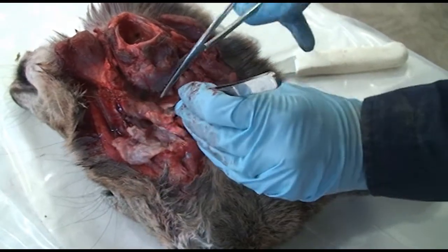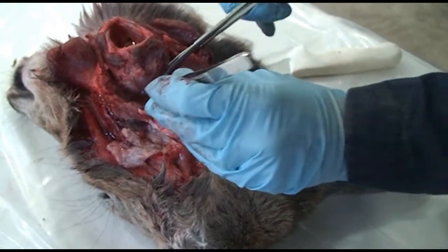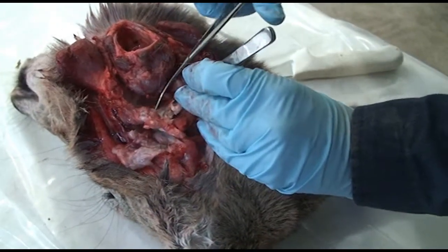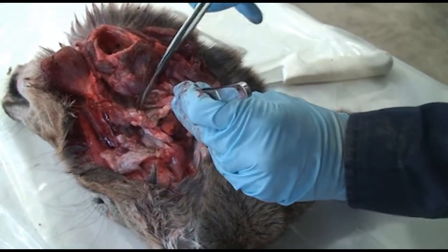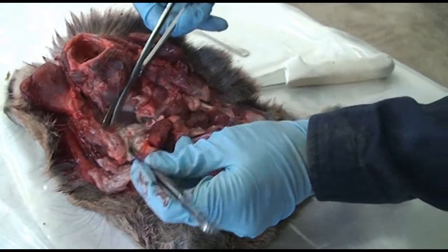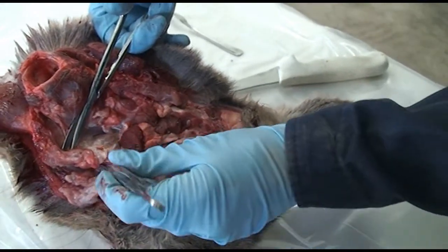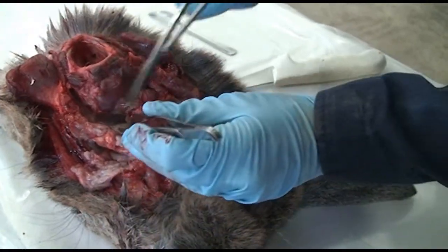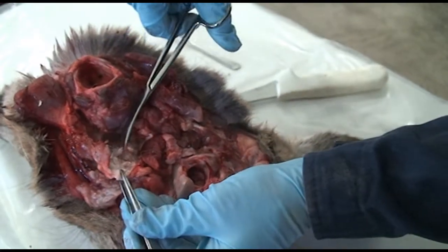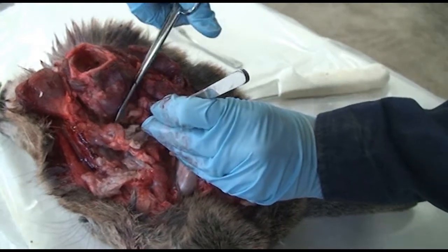The reason they want the retropharyngeal lymph nodes is for chronic wasting disease. You're going to find the abnormal prion, if they have it, in the highest concentration and the earliest in the retropharyngeal lymph nodes. And so that's why that's the lymph node that we want and not the submandibular. You can see this lymph node's starting to pop out at us down here. They're typically tan in color, but they can be hemorrhagic in color. They can be red. They can be purplish in color. But most of the time in a healthy deer, they're tan.